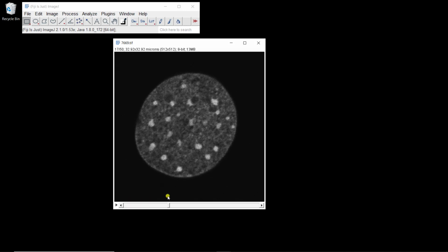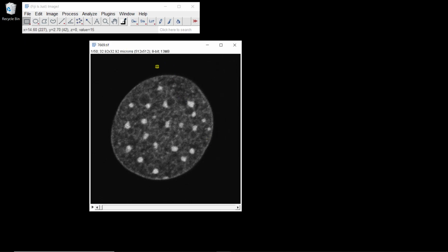So this region is photobleached at time 3, and then you can see how it recovers. In this video, we're not going to be interested in that experiment, but just to see how we can use regions of interest that are defined as lines to do some quantification.